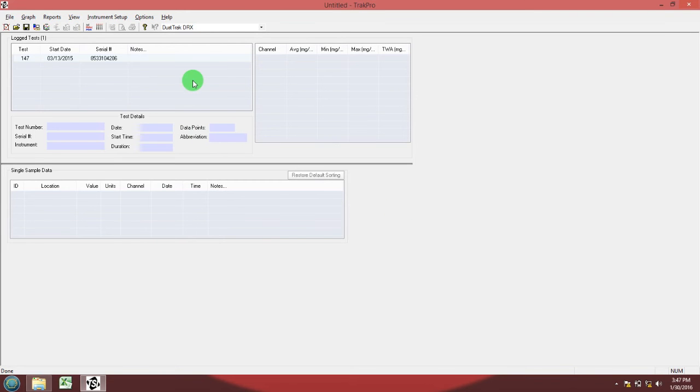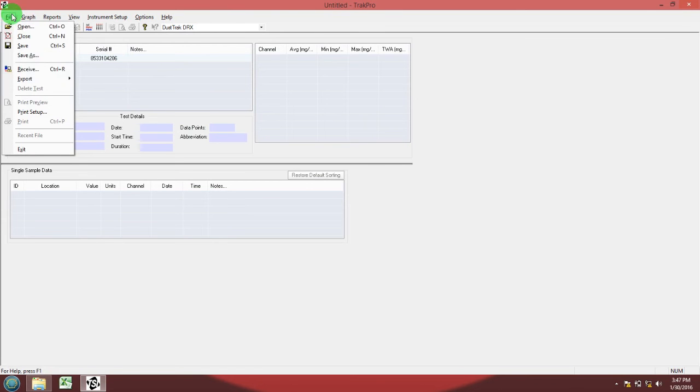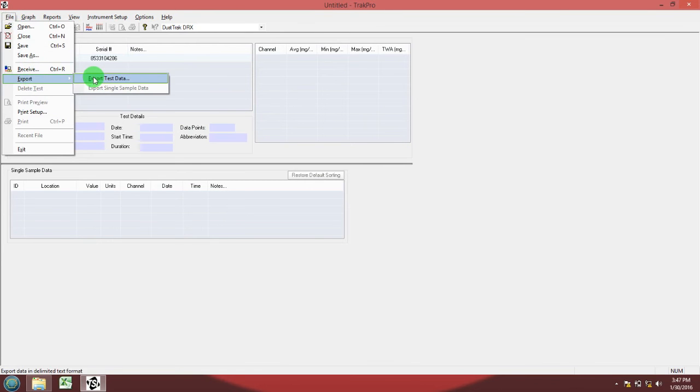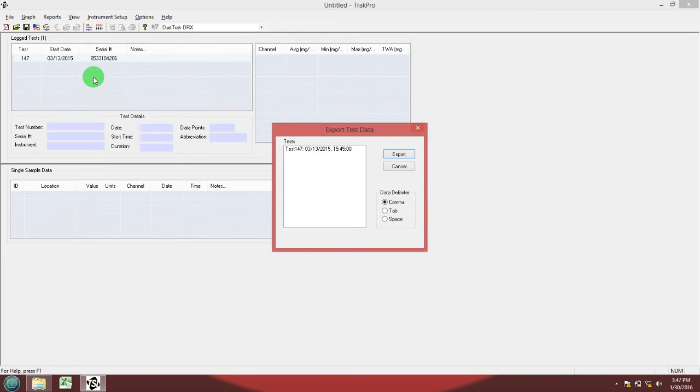You must do another step. Go to file, export, export test data. Now select the data that you imported to TRACK PRO. Make sure comma is selected.